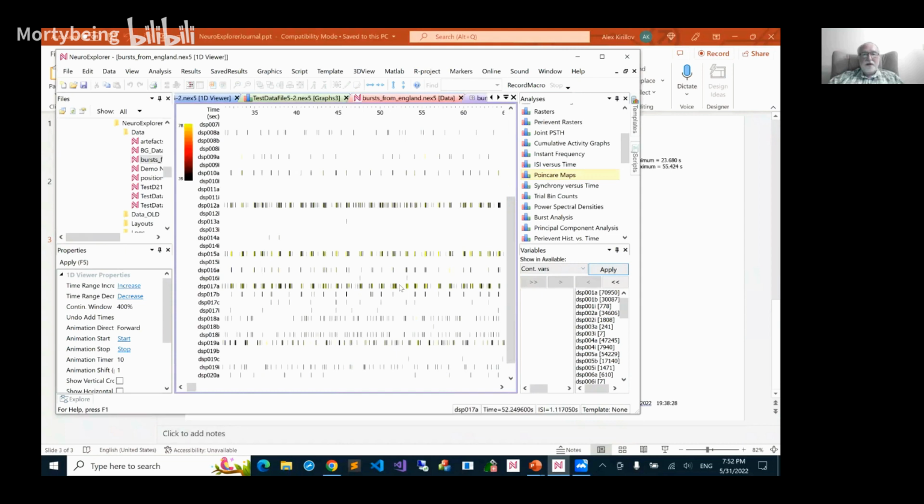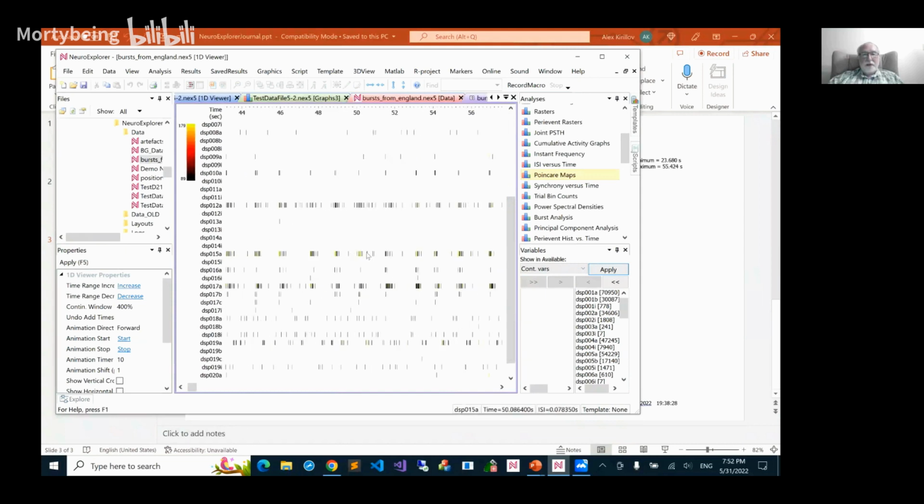You can see that the neurons have this period of inactivity, and then what is called a burst. We have a small interval that starts this period of activity, and then several spikes that go one after another in a very short burst. That's why it's called a burst interval. So we have analysis that will identify the start and end of this burst.